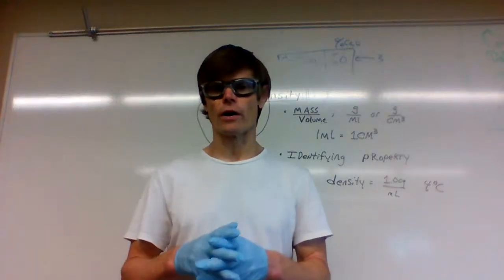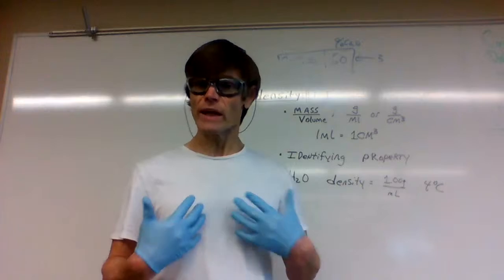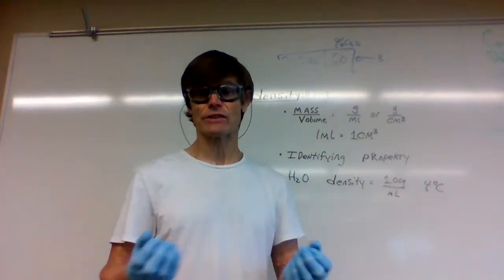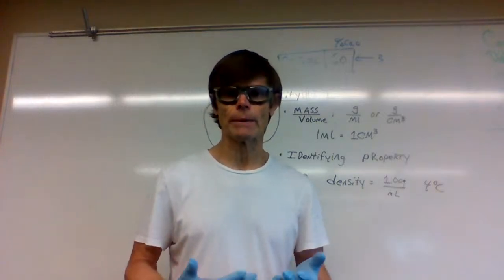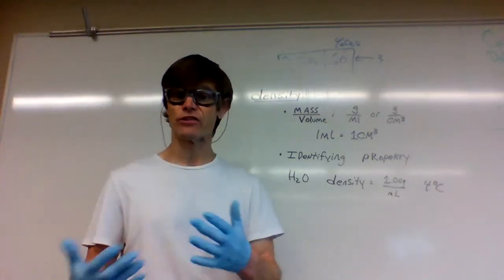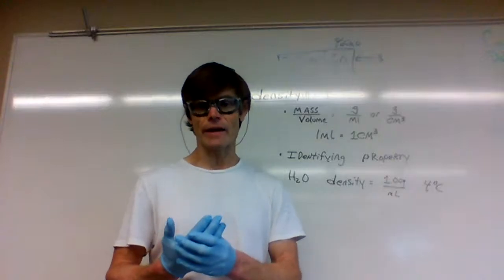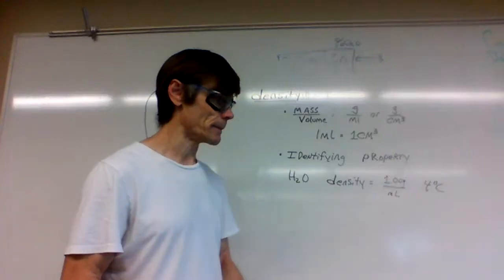Today, we're gonna focus on an experimental parameter that we can determine, and there are also tabular lists of what density is. So we're going to begin with just briefly discussing a little bit about what a sample's density is. So I wrote some notes up here, and I'm going to go over it and go over a couple sample calculations, go over how we can determine the density of a subsample of matter experimentally.